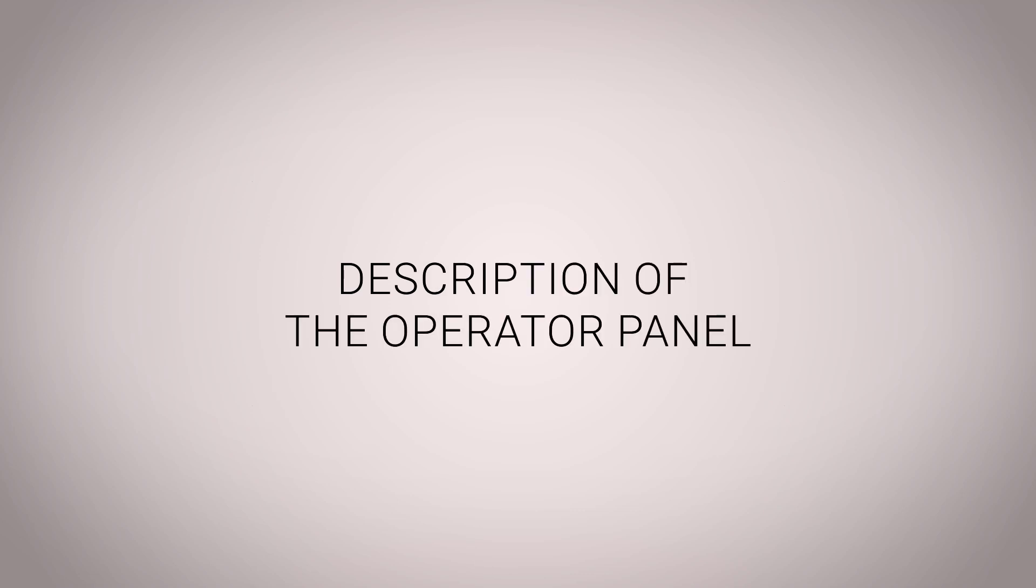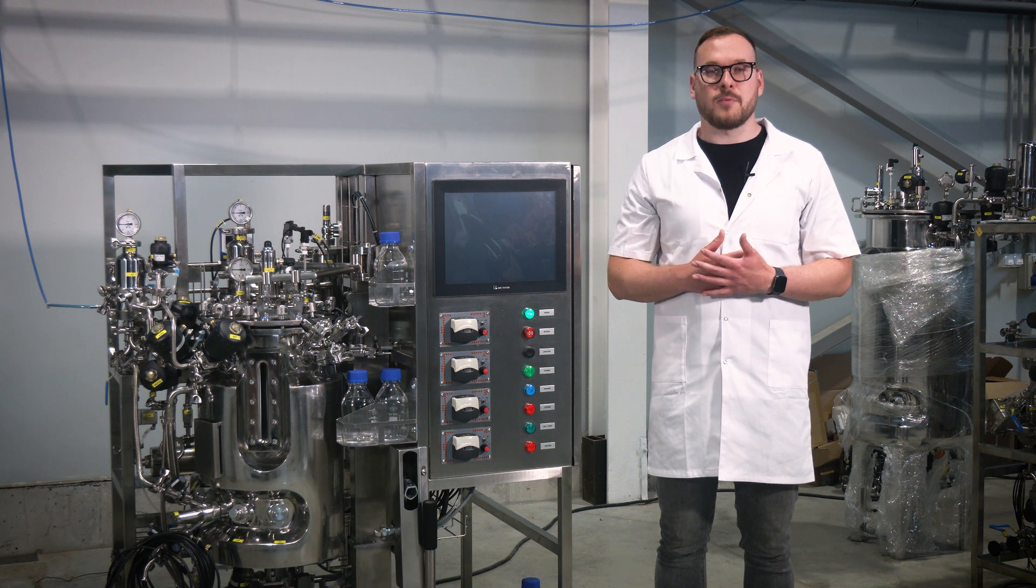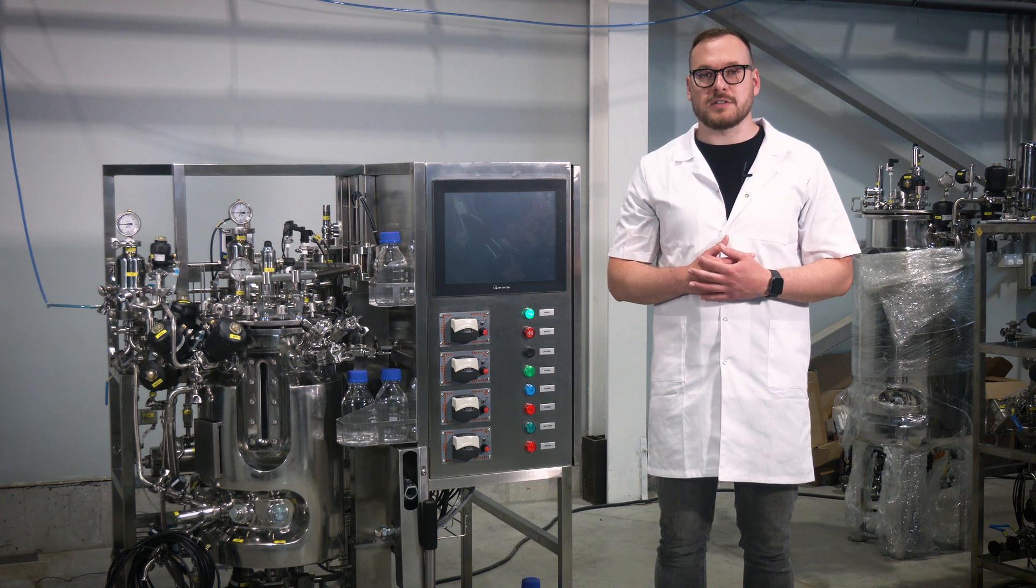Description of the operator panel and administration. In this section, we will cover the operator panel and administration of the stainless steel bioreactor.